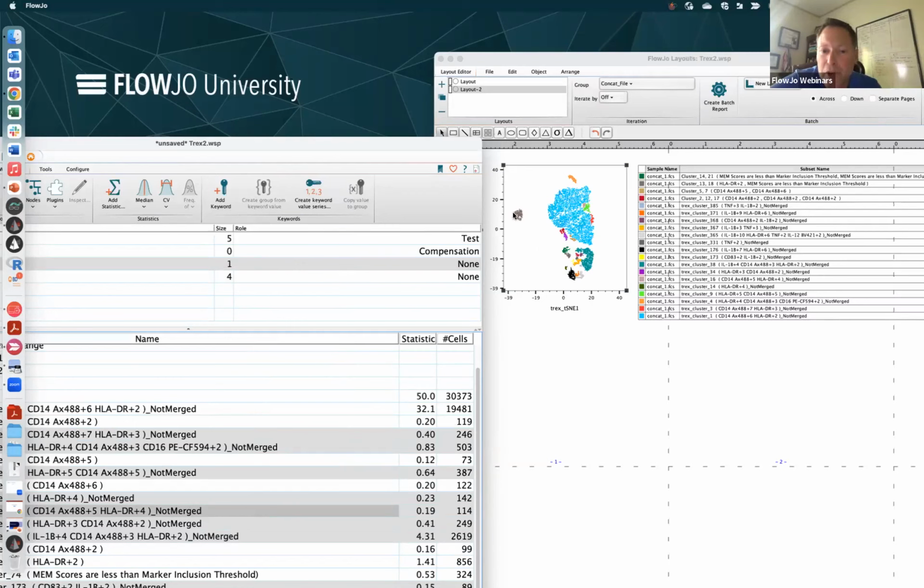This gray one used to be two separate clusters, now they're merged. They were functionally the same. So that kind of makes sense in that they're right there together on the plot, isolated from everything else. And I guess the other one's the tan one, so it's this right here. Yeah, okay, cool.